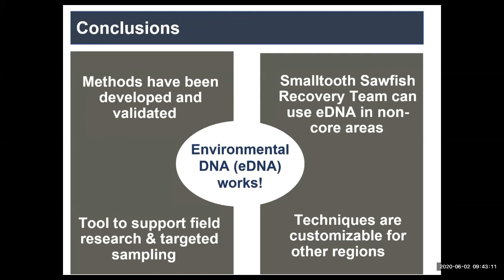The methods have been developed and validated through our sterilization process, our species-specific primer, and using the ddPCR. We use this as a tool to support field research and target our sampling. The Smalltooth Sawfish recovery team can use the eDNA in non-core areas, and these techniques are customizable for other regions.